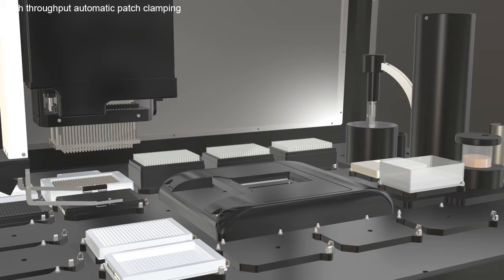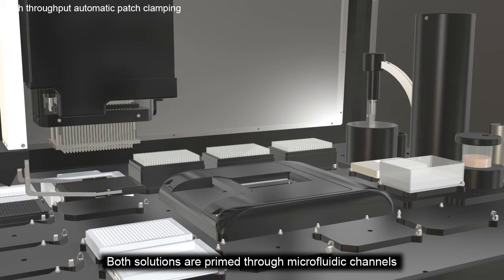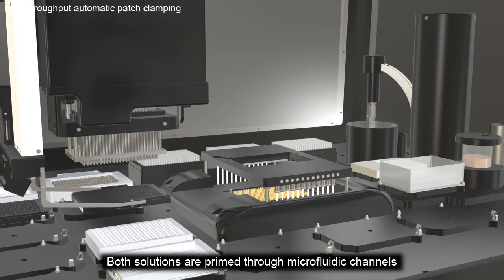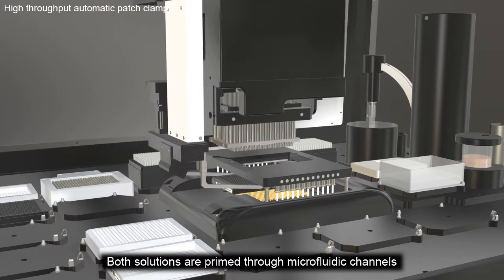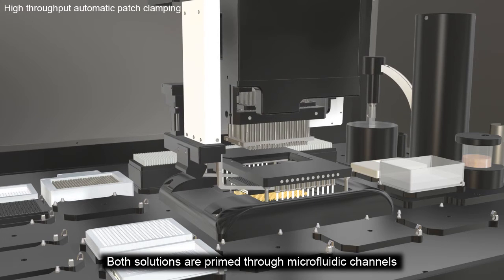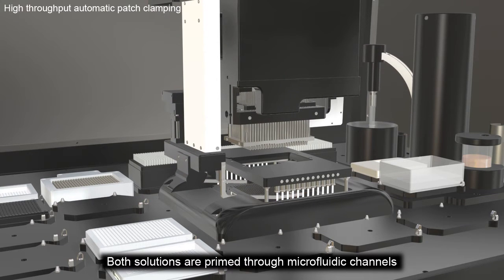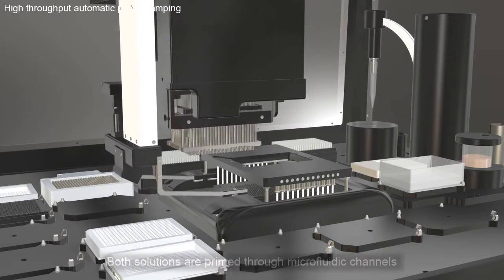The pipetter moves the Q-Chip to connect the Q-Chip consumable to the measuring station, where 384 pairs of gold pins in the testbed connect the Q-Chip consumable to the individual amplifier's channel.